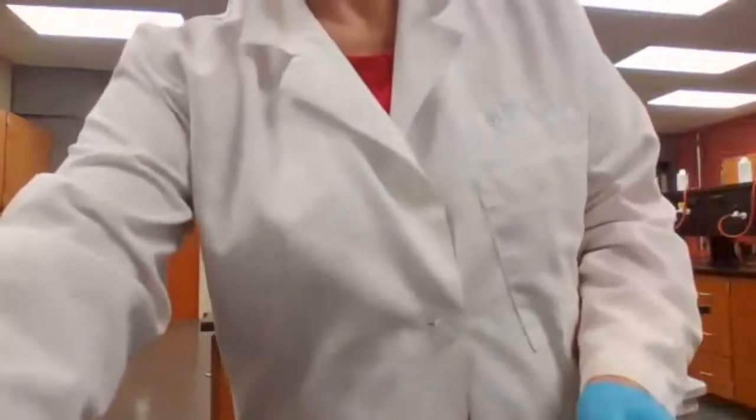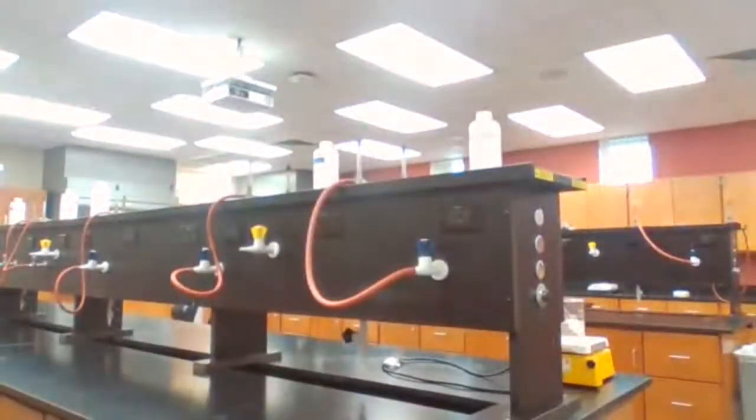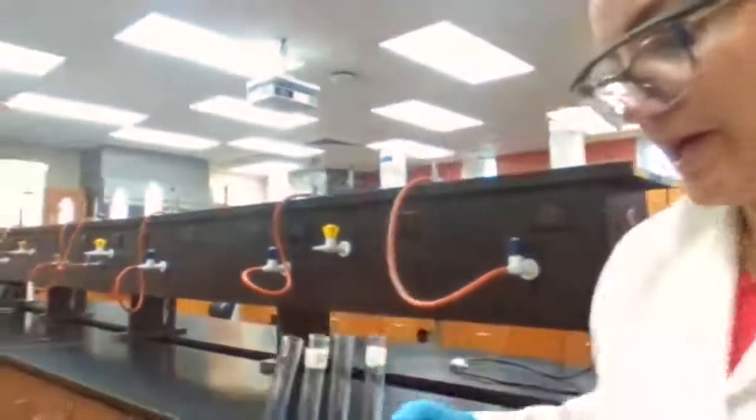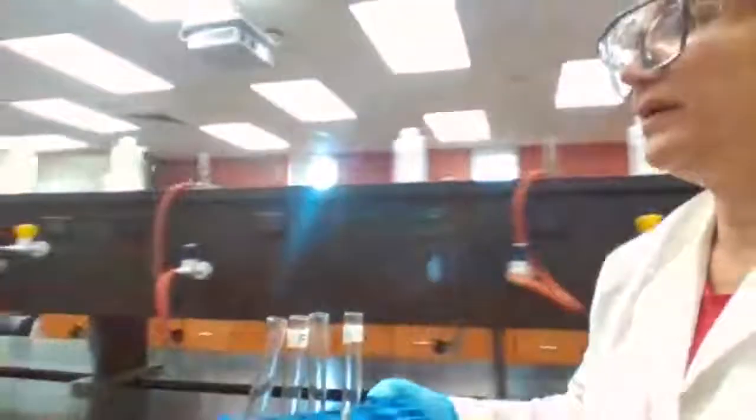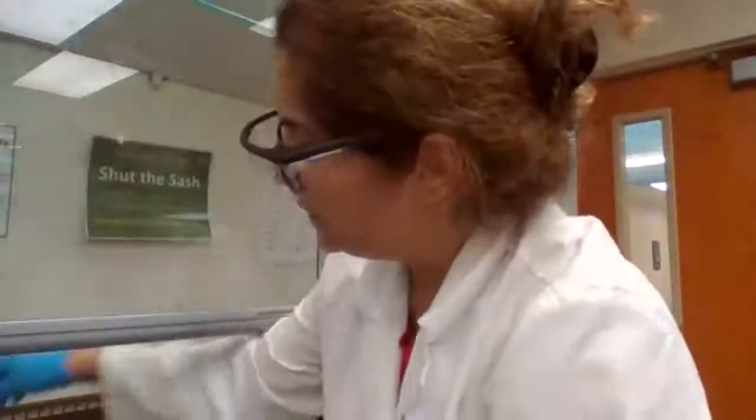Okay. So let's go to the fume hood. Just hope that when I come back, I remember 5 drops of each and 20 drops of the reagent. Okay.